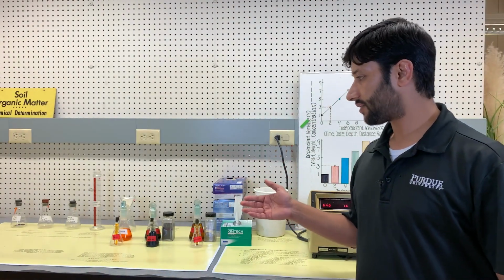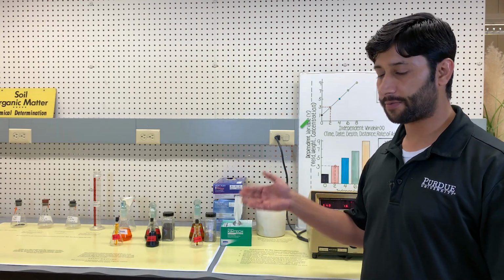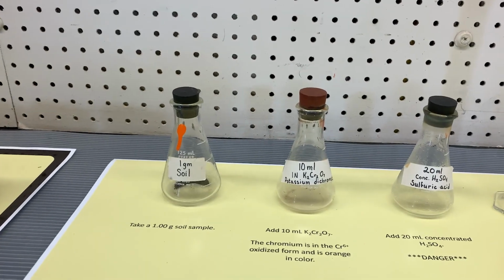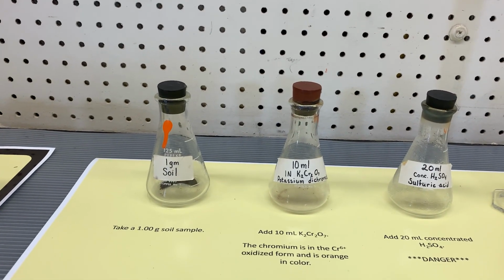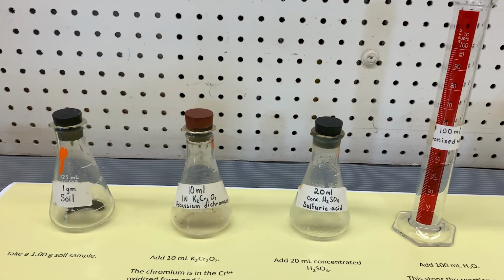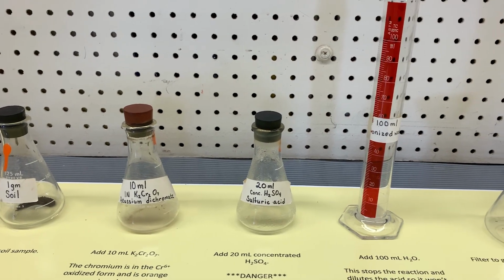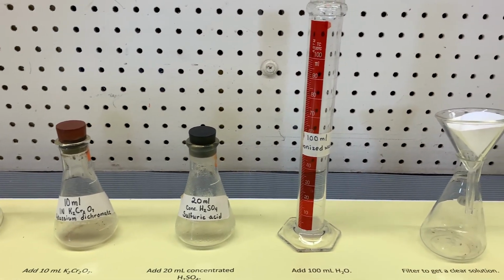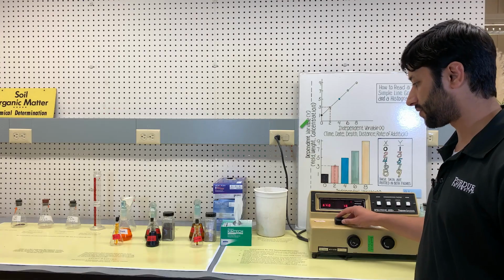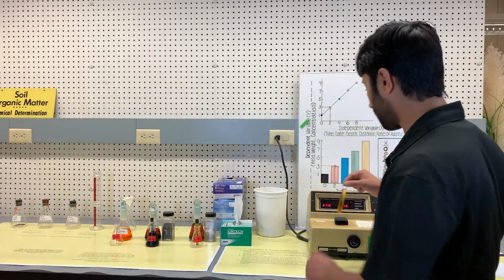In this method, we are trying to determine the organic matter content based on the colorimetric method. So we will have 1 gram of soil that we will add 10 milliliter of the potassium dichromate to, and then we will add 20 milliliter of concentrated sulfuric acid, and then we will add 100 milliliter deionized water. Once we get the filtrate, the samples are ready to be read in the spectrophotometer. So this is the blank sample. We need to do the calibration first.